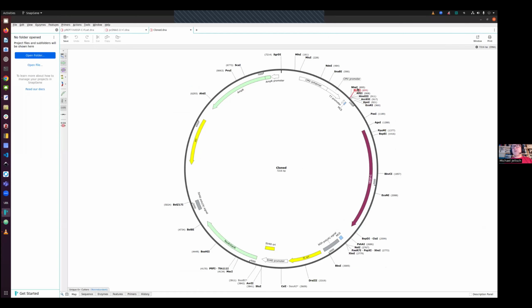Still something about selecting restriction enzymes. Some people have been using HindIII, some people have been using BamHI, there are so many different possibilities. How do you choose a good one? Not all restriction enzymes are created equal.